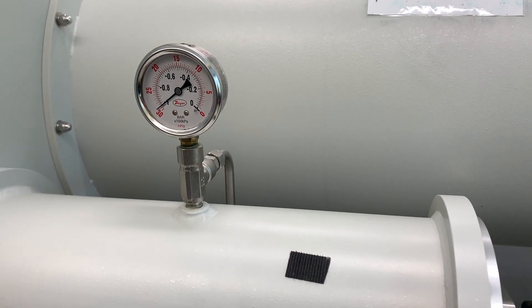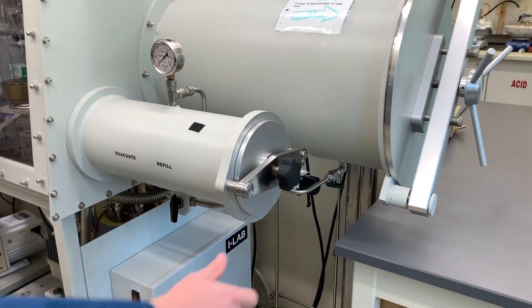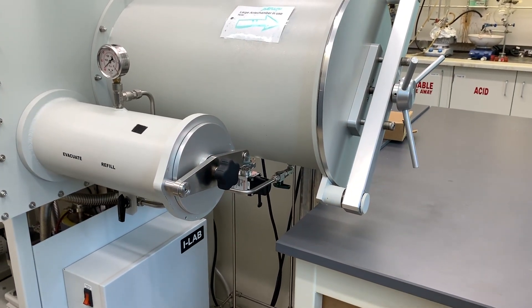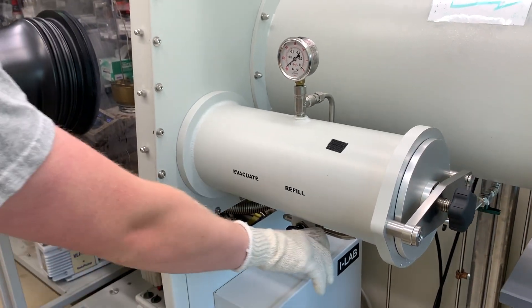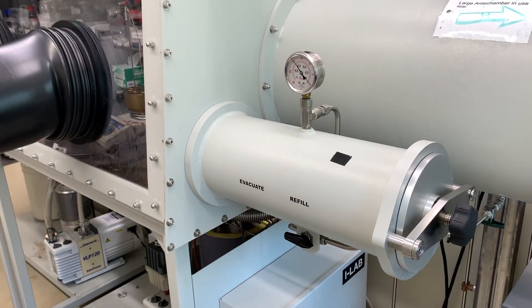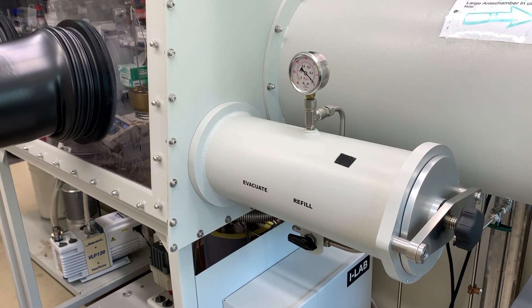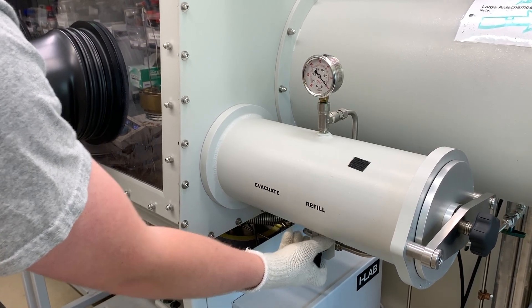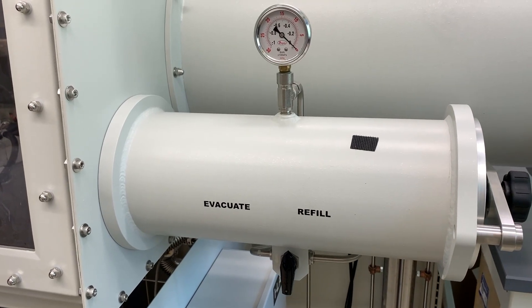Here's a very important point. Whenever the antechamber is evacuated, do not try to open the doors or even turn the knobs. You can do some serious damage to the door while it's under vacuum. If you want to bring something through the antechamber, it must be at atmospheric pressure before opening either door. Turn the valve to refill until the vacuum gauge reaches zero, then turn the valve back to the vertical or neutral position. You're now able to open the door and fill the antechamber with whatever needs to be transferred.